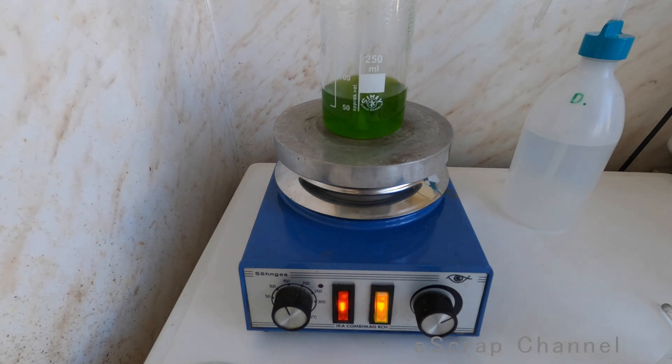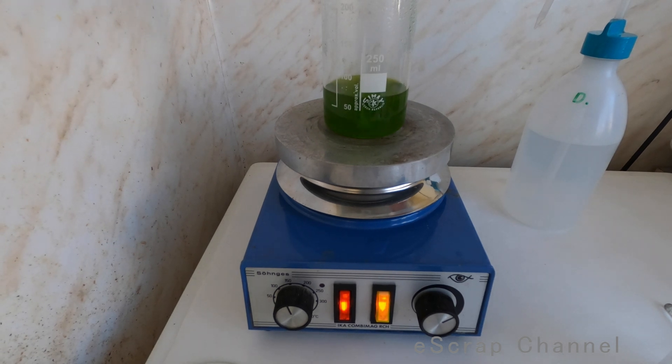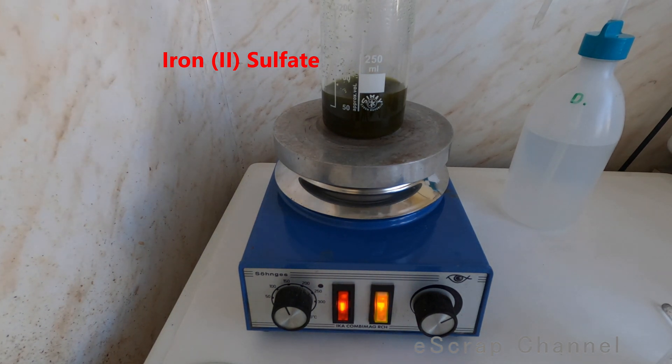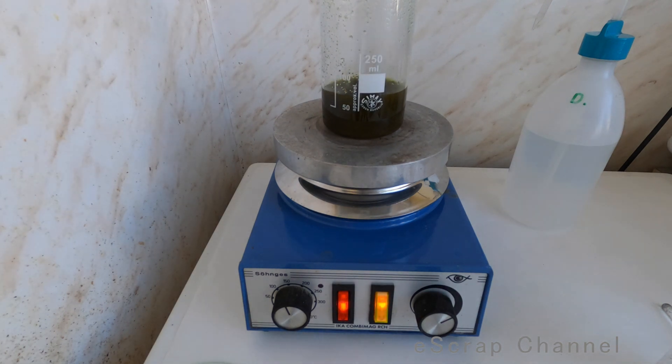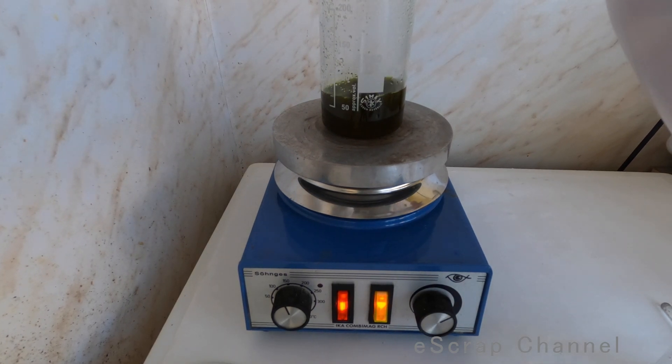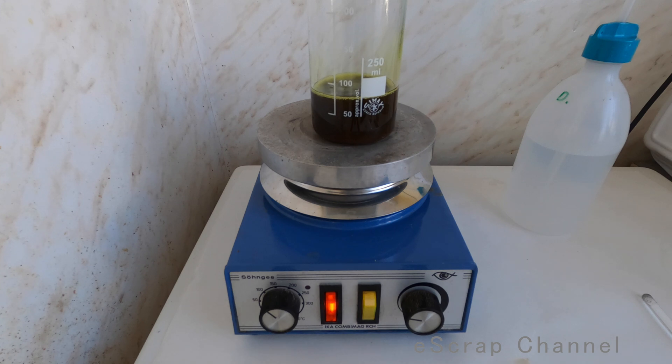Let's set our iron sulfate and see if we have any gold inside. Oh yes, we do — look at the reaction. So that's our gold. To precipitate the gold, what you need is volume — you don't need an extremely concentrated solution, that's important. And the second thing: heat. Usually when you have these two, you will precipitate your gold. We are ready — let's leave this solution for about one hour, then let's check our gold at the end.